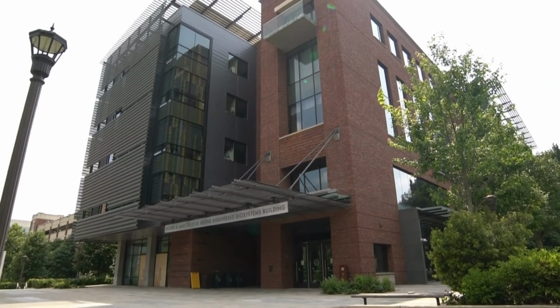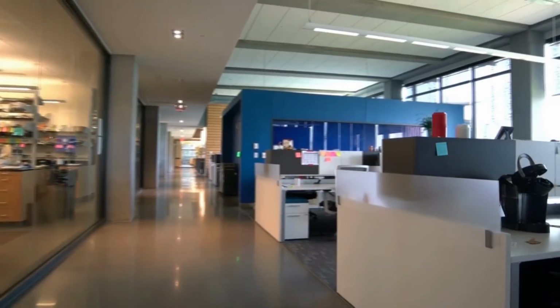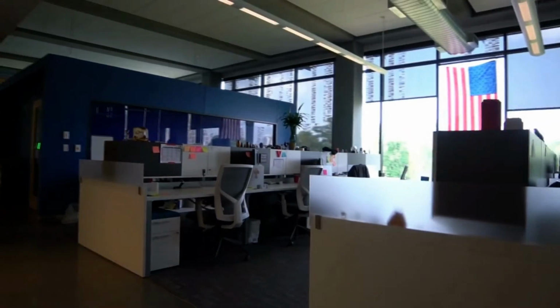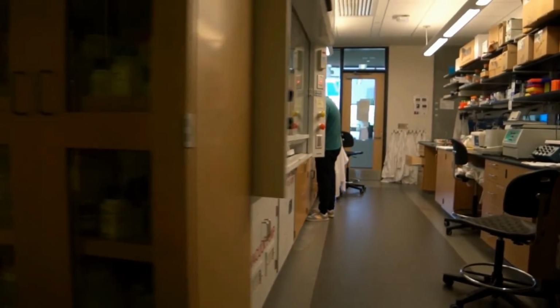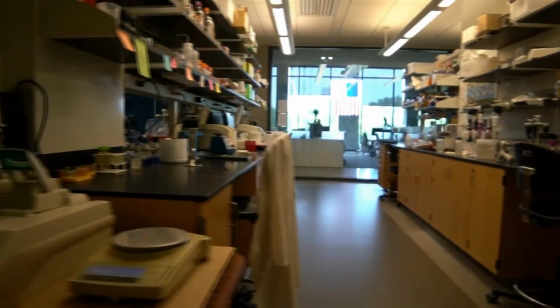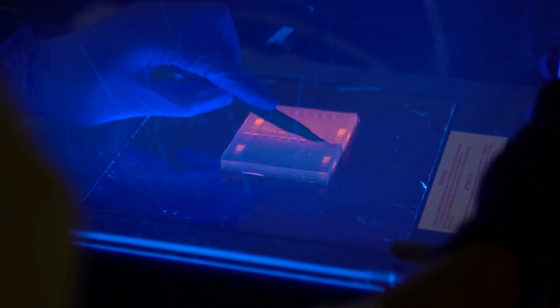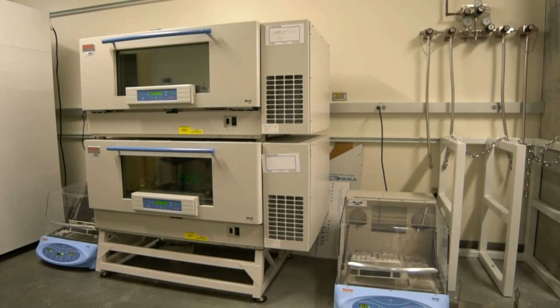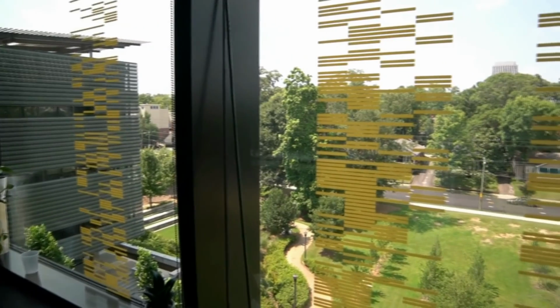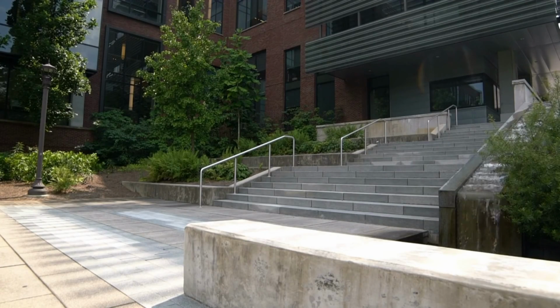Our lab is located in the Engineered Biosystems Building, or EBB, one of the newest buildings on campus. The labs in the EBB have an open floor plan that integrates the office and lab space. Here's a view of our benchtop workspace. Our lab is outfitted with standard molecular biology equipment, including thermocyclers, microwell plate readers, a gel electrophoresis station, and multiple incubator types. Aside from being a beautiful workspace with great views, the EBB has extensive equipment available, including core labs with advanced facilities like flow cytometry, real-time PCR, light sheet fluorescence microscopy, mass spectrometry, and the like.